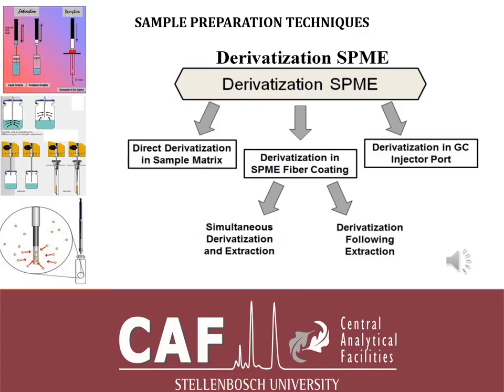If one is doing derivatization in the SPME fiber coating, that is on fiber, you can do simultaneous derivatization and extraction, or derivatization following extraction. Simultaneous derivatization and extraction is everything together. The derivatizing agent gets absorbed on the fiber, and from there on in the sample.